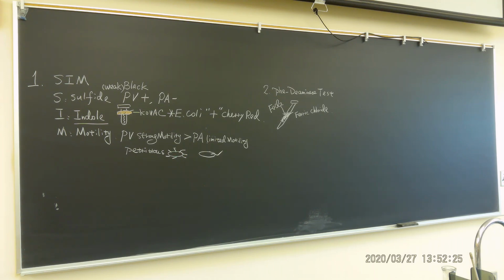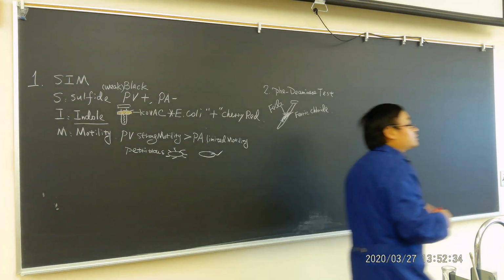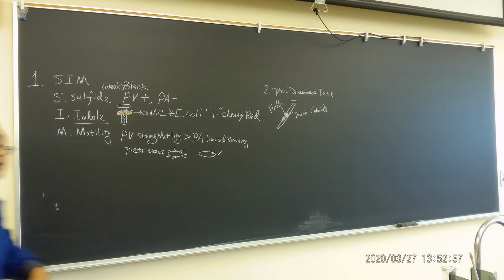Who has Pseudomonas aeruginosa? Can I have one? Yeah, that's good. We'll see what it is. Then you shake a little bit. And can you let them do an E. coli? Okay. Now let's get those samples to see if there is any difference.